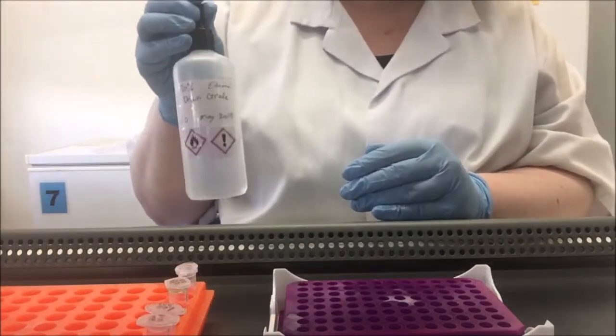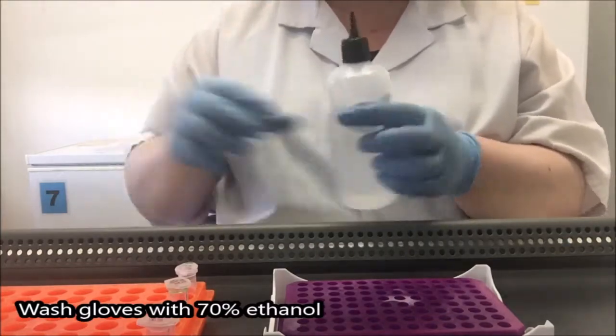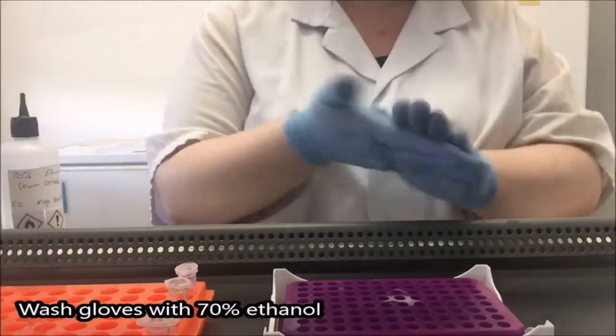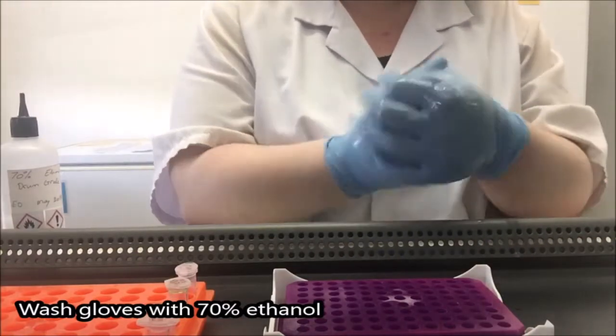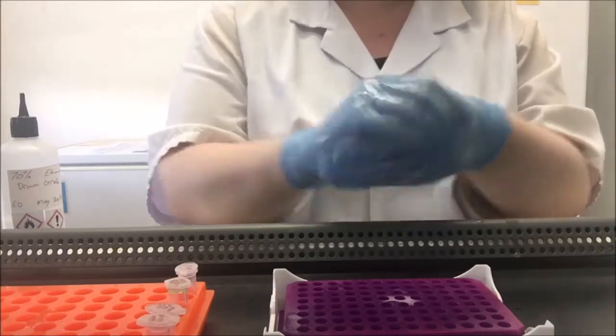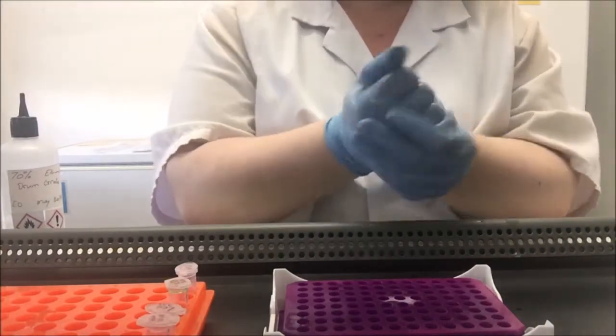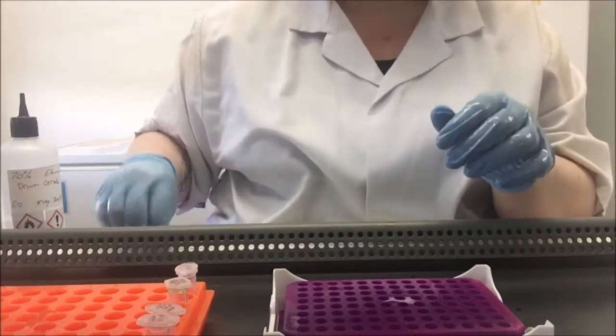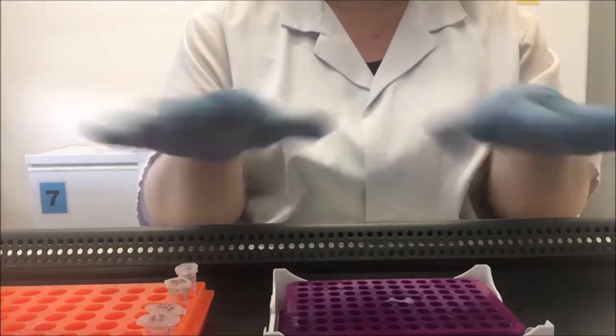The first thing I'm going to do is wash my gloves using 70% ethanol, because my gloves are not actually sterile. And this will get off any bacteria or DNA that I've picked up on my gloves while I was preparing my work area or that might have been present in the box of gloves. So ethanol will evaporate fairly quickly. I just give that a minute to do that.